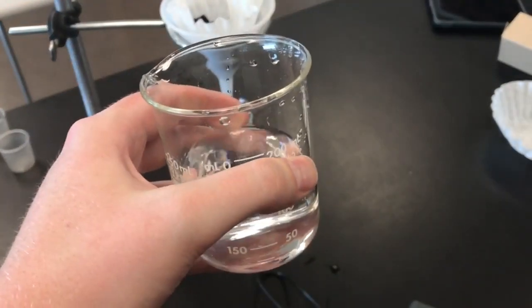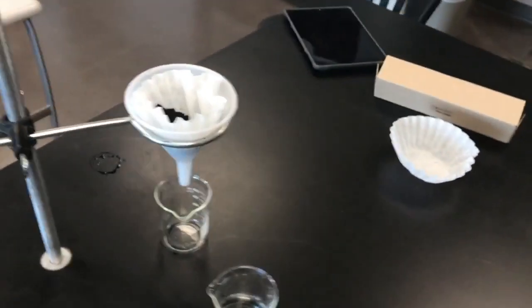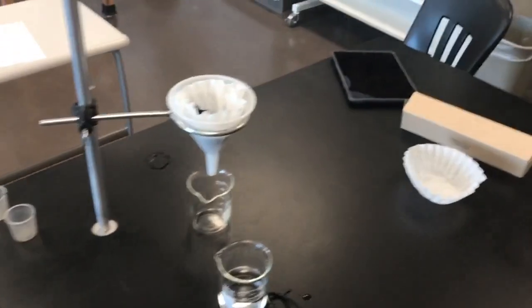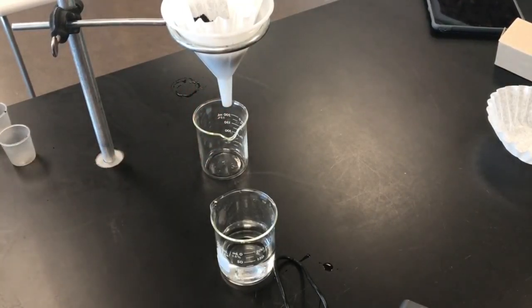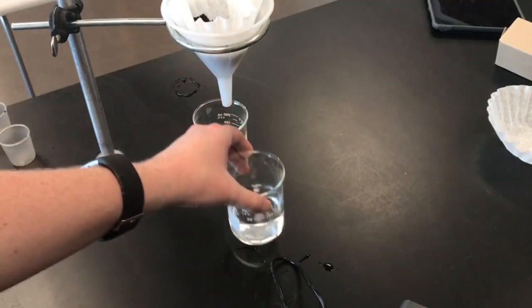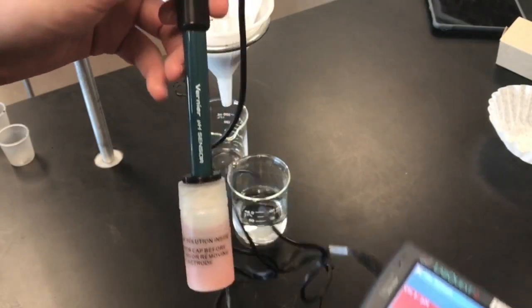Now that I've got my 100 milliliters of sulfuric acid solution, I can start running procedure 1. So again, make sure you have your soil type A in your funnel set up, with an empty beaker under here that's going to catch all the water discharge. What we need to do first is take an initial pH reading of the initial sulfuric acid solution. So I already hooked up my pH probe to my LabQuest device.